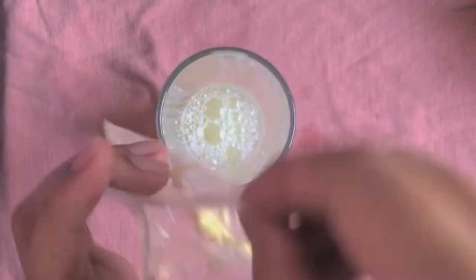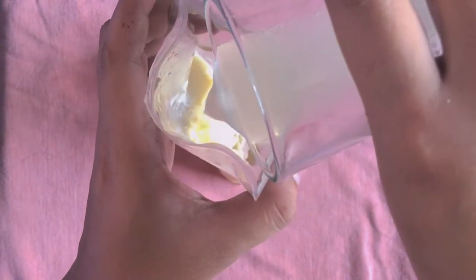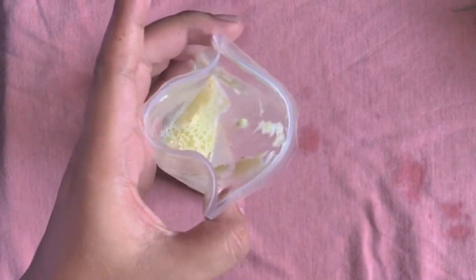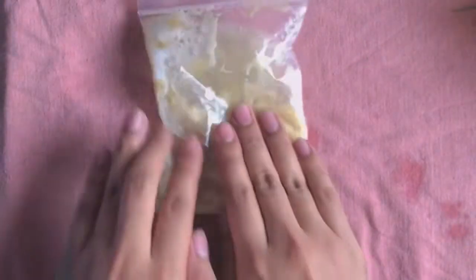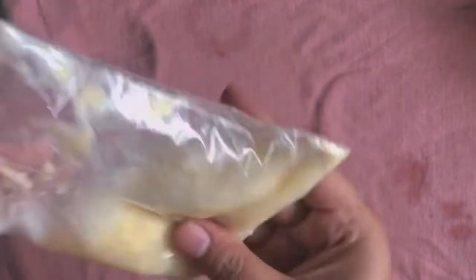Now let's add the mixture into the smashed banana from earlier. We just need to seal it properly, and we are just going to mix it. But we must avoid it getting bubbly, so we should mix it slowly.